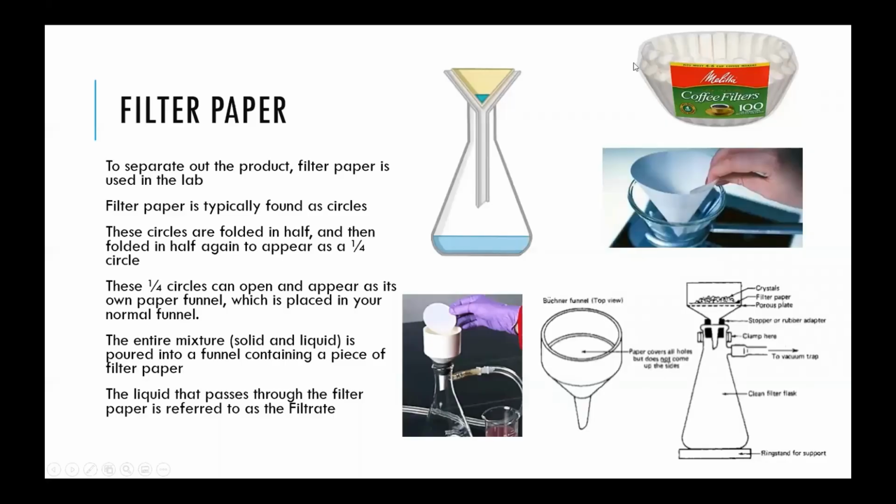So in these reactions, when you're going through and performing or watching these reactions, they're being filtered through filter paper. You've probably seen filter paper and not even realized it, such as coffee filters.